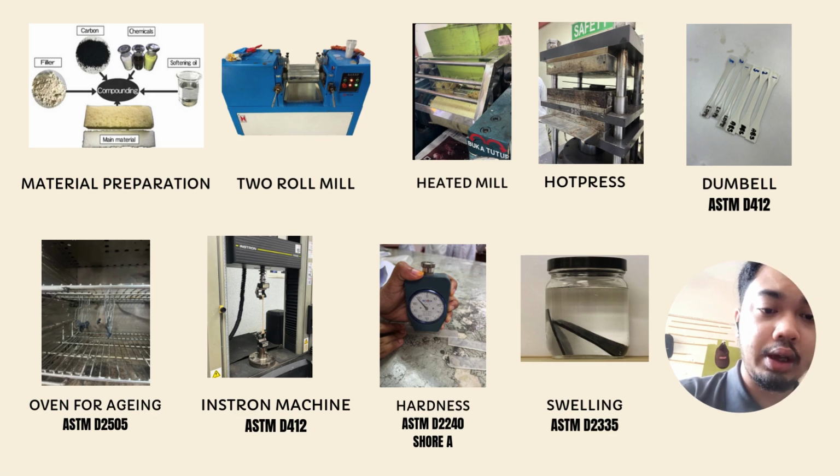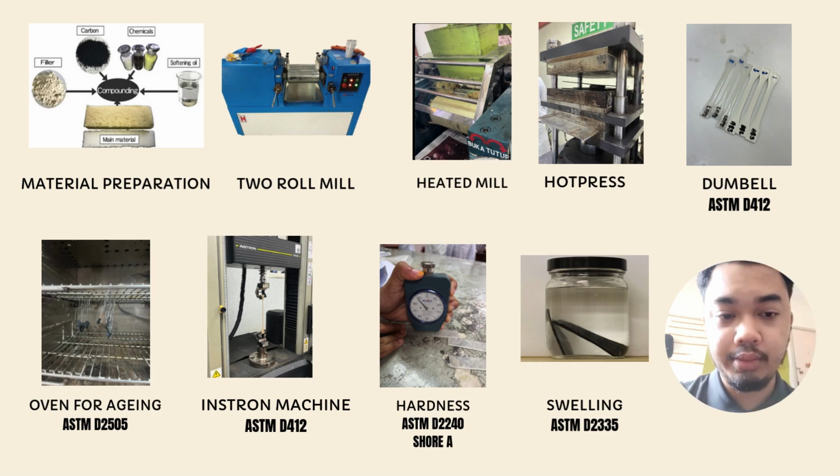Then we have swelling. We use ASTM D2335. That means testing in liquids, and we have toluene and oil, cooking oil, and petrol. Okay.